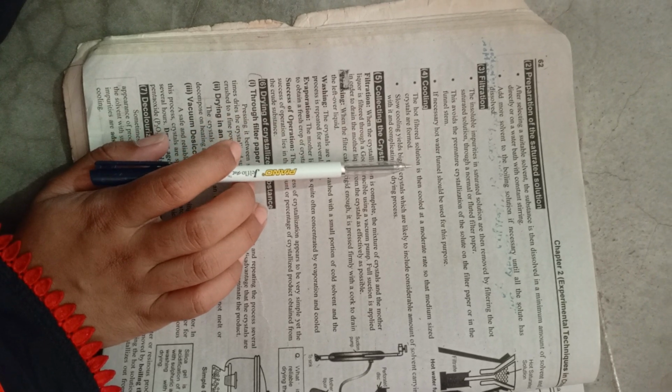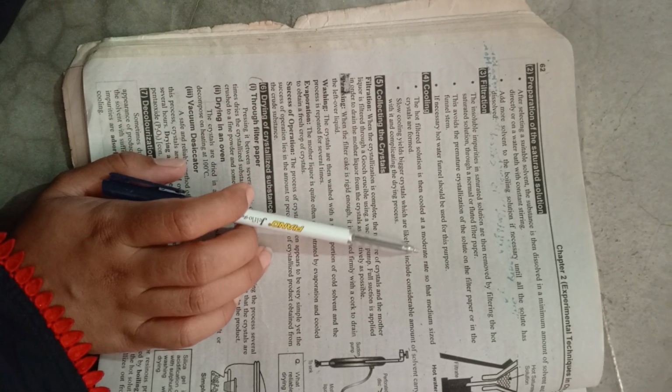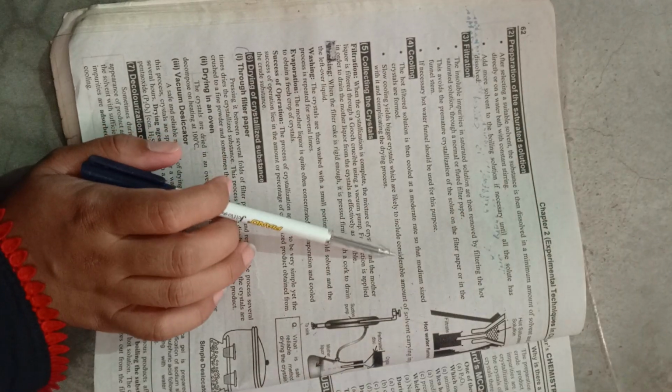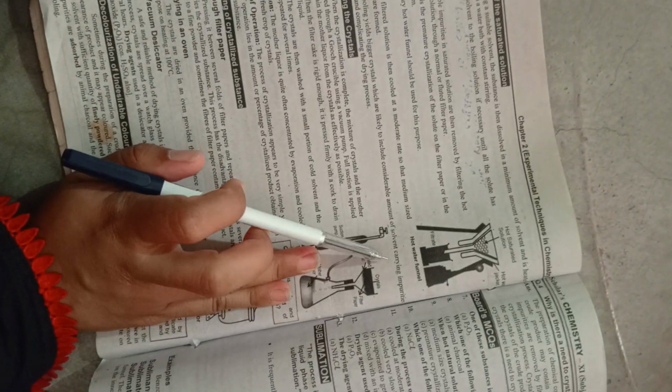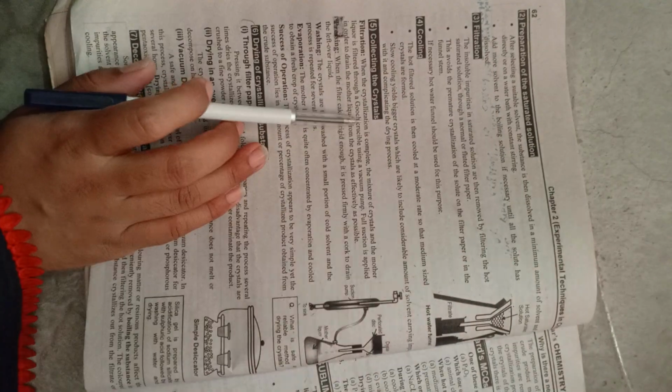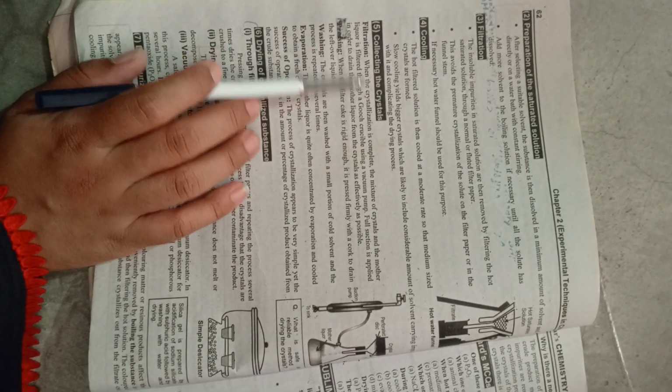Cooling: the hot filtered solution is then cooled at a moderate rate so that medium-sized crystals are formed. आगे है slow cooling yields bigger crystals which are likely to include a considerable amount of solvent carrying impurities with it and complicating the drying process. आगे है collecting of the crystals.